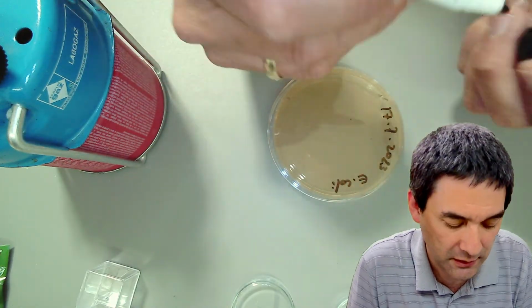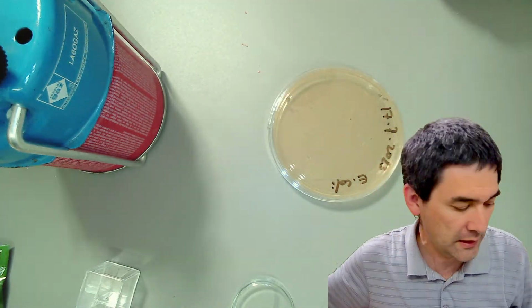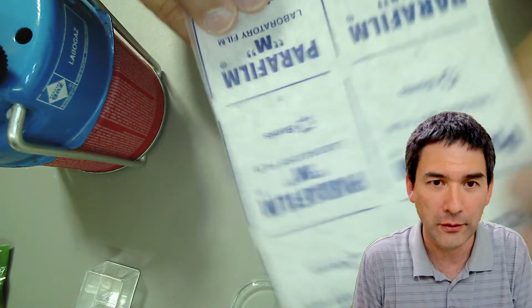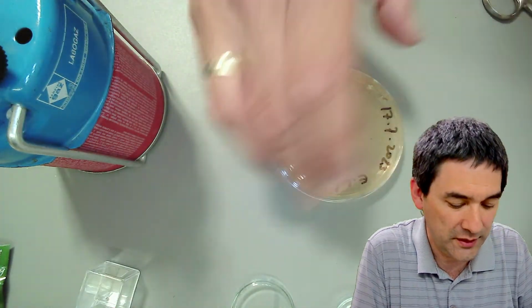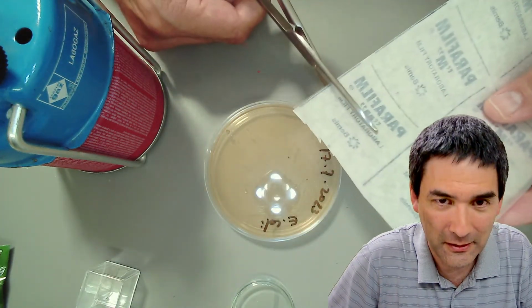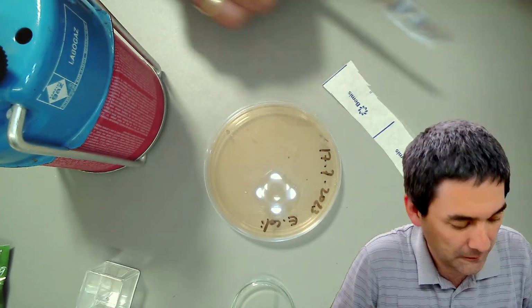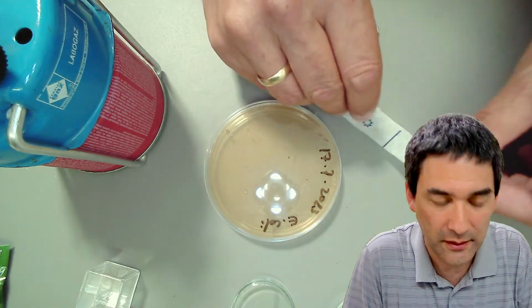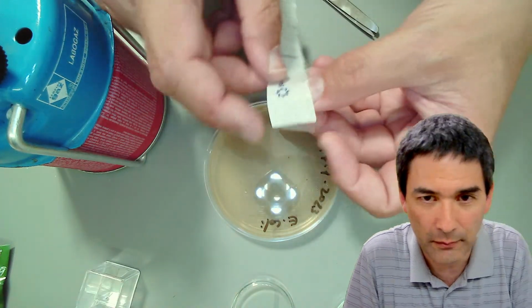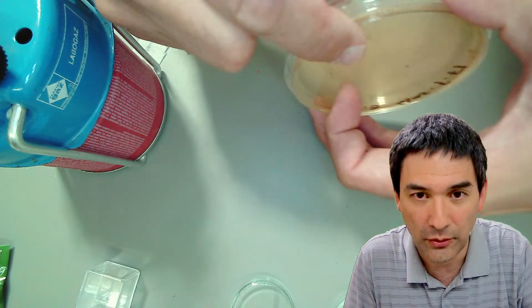So that's basically almost finished, because I'm going to show you now the coolest invention ever, and that's this one here. It's called parafilm. I love this. This is actually a fun part. I'm going to show you what this does. I think this is the coolest invention in the whole lab area. I'm going to cut off a little strip here of parafilm. And this is the protective paper covering that I'm going to remove now. And I'm going to go on the corner here.